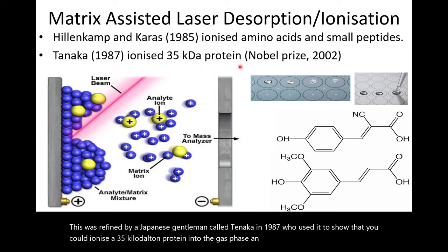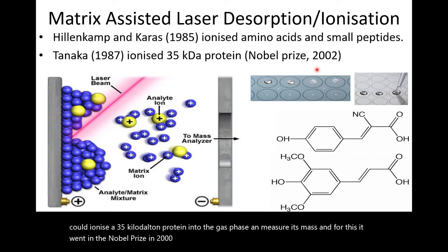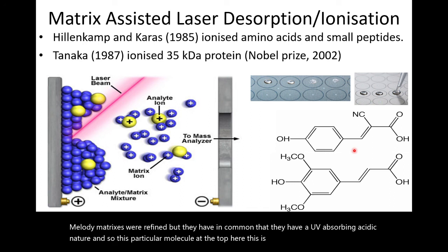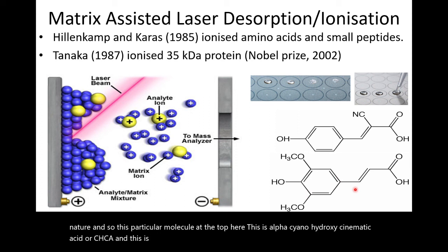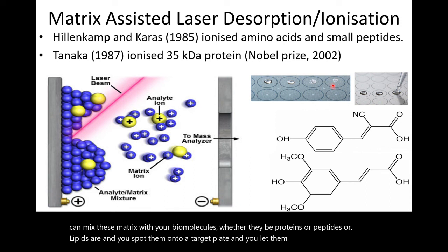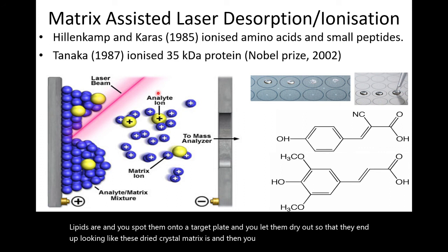Over time, MALDI matrices were refined, but they have in common that they have a UV-absorbing acidic nature. This particular molecule at the top here is alpha-cyano-4-hydroxycinnamic acid, or CHCA, and this is another molecule called sinapinic acid. So what you can do is mix these matrices with your biomolecules, whether they be proteins or peptides or lipids, spot them onto a target plate and let them dry out so that they end up looking like these dried crystal matrices. Then you put them into the vacuum chamber of the mass spectrometer and fire the laser at them so that the ions are desorbed into the analyzer.